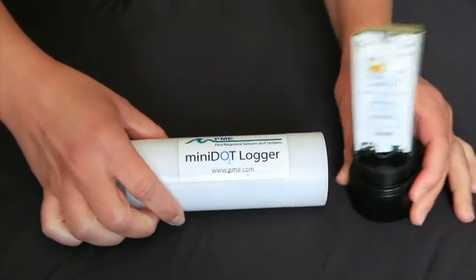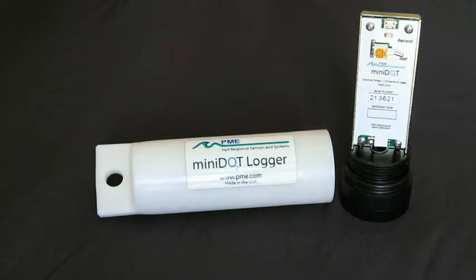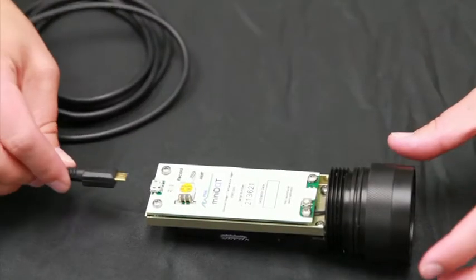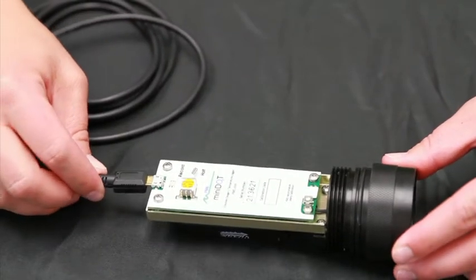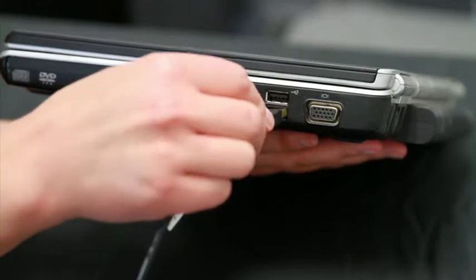First, open the case of the mini dot logger by unscrewing the white housing from the black end. You will now need to connect the mini dot logger with the supplied USB cable to your host computer. Plug it into the logger and then plug it into your USB port on your computer.